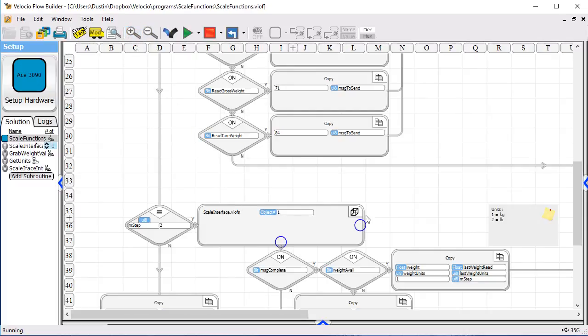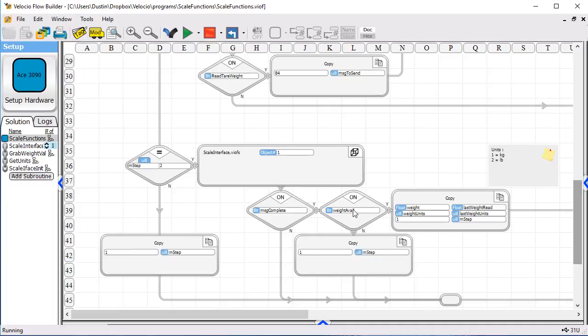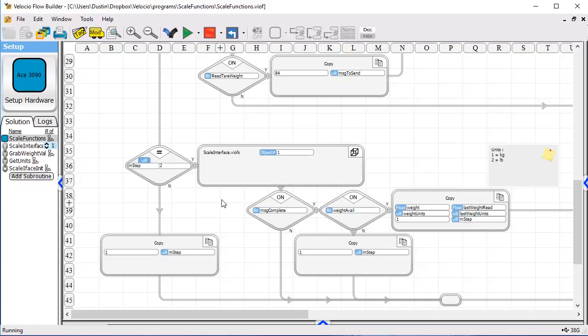Which is where we call scale interface. So we're in step two now. Scale interface is called until we're done with step two, until we've done the communications. You'll notice we call the subroutines. We do not pass any data into it because it's already got the references.